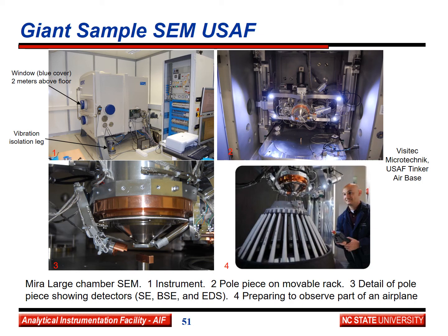And since you don't want to necessarily cut the engine up to take a look at it, they put the whole thing inside there, position the microscope very carefully, because this part right here needs to be about 15 or 20 millimeters from the piece that they're going to look at. Then they close the door and evacuate this whole giant chamber, which I imagine takes some time before they can start looking at the sample.